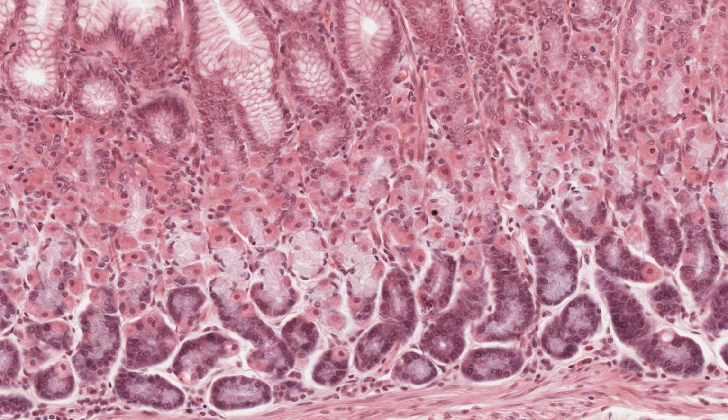They're artifacts. So now I think you should be familiar with hematoxylin and eosin staining. Next, I'm going to describe some of the limitations of using hematoxylin and eosin stains.